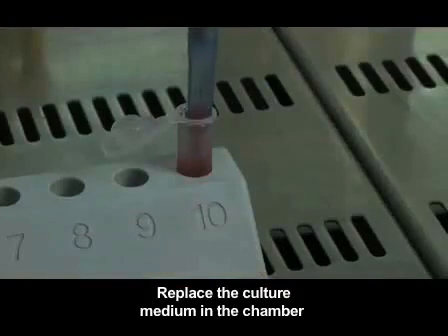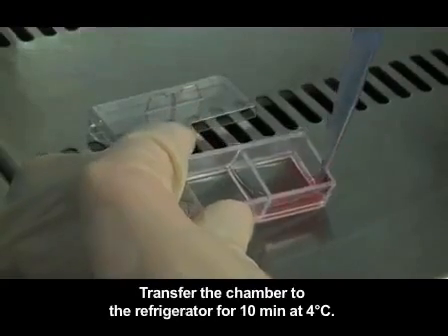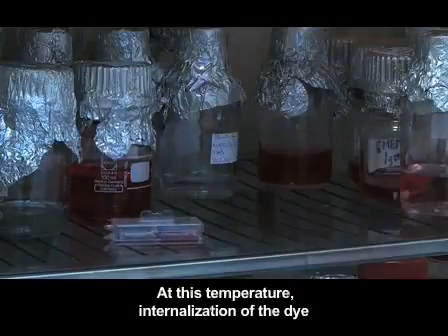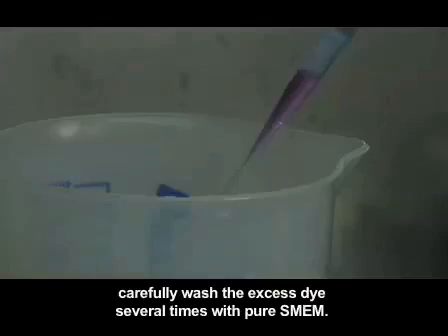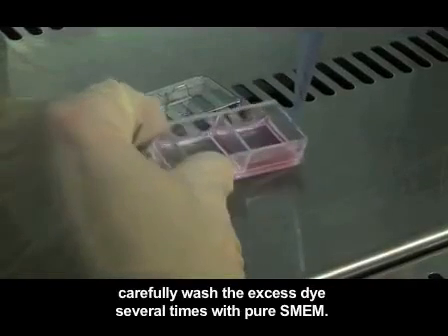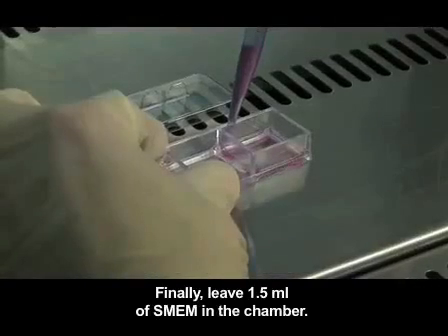Replace the culture medium in the chamber with the loading solution. Transfer the chamber to the refrigerator for 10 minutes at 4 degrees Celsius. At this temperature, internalization of the dye through the plasma membrane is largely inhibited. After staining, carefully wash the excess dye several times with pure SMEM. Finally, leave 1.5 milliliters of SMEM in the chamber.